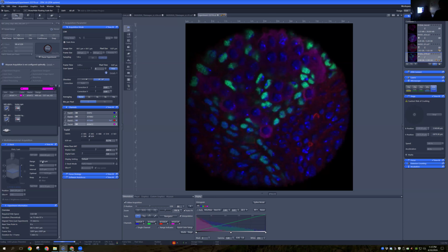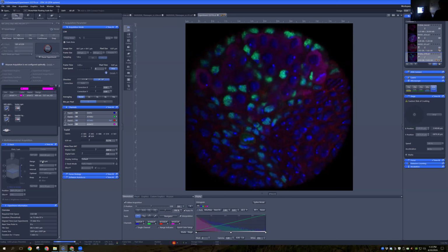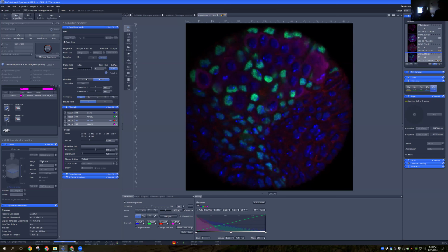It was like several months of just showing up to lab every day and destroying a bunch of ovaries and larvae and getting nothing, and then being like, okay, well, time to go home, and I'll do this again tomorrow.